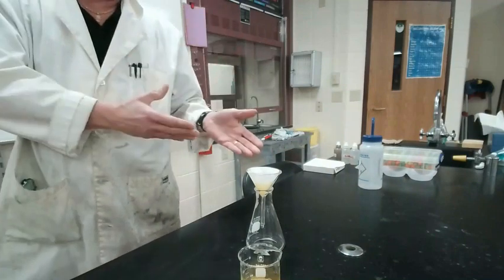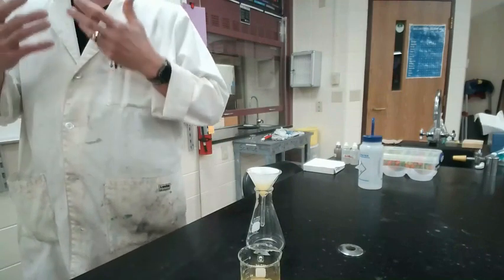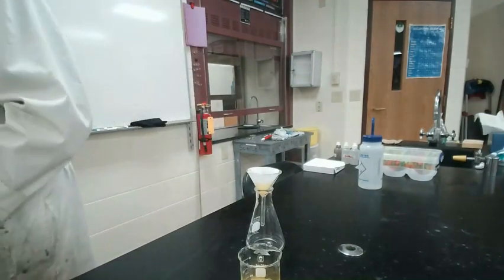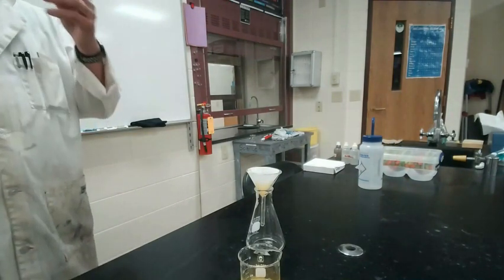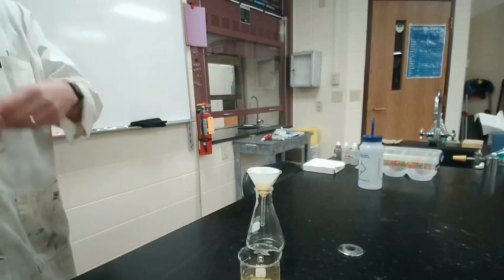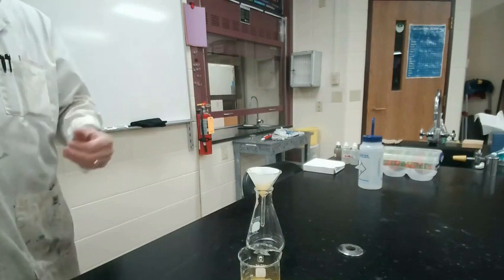Then when I get rid of that water in a second, by doing more of this filtering, I'm going to be getting more dry precipitate. In the lab, we did this 2 or 3 times where we rinsed down what we call our precipitate. We added water to it so that we would take the ions, the sodium nitrate that was in there, dilute it into the water, and dump it through the filter paper.